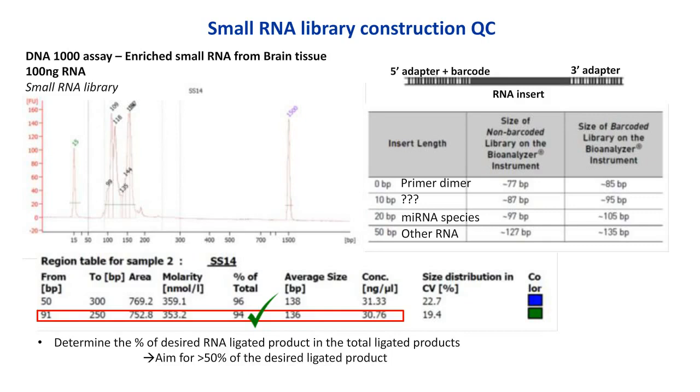So you can see in my bioanalyzer trace here that I have a number of peaks. And this 109 peak could be mostly microRNA and then other small RNA species. When you perform a small RNA smear test, what I do is gate the entire library, 50 to 300, and then also gate what I'm actually interested in, which is anything beyond 91 base pairs, which will have an insert, and then to 250.